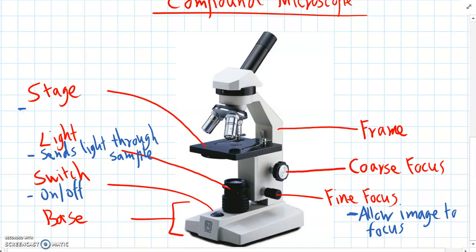And the stage is where we put our specimen on. And the light passes through it through this little hole in the middle of the stage. So the stage holds the specimen.